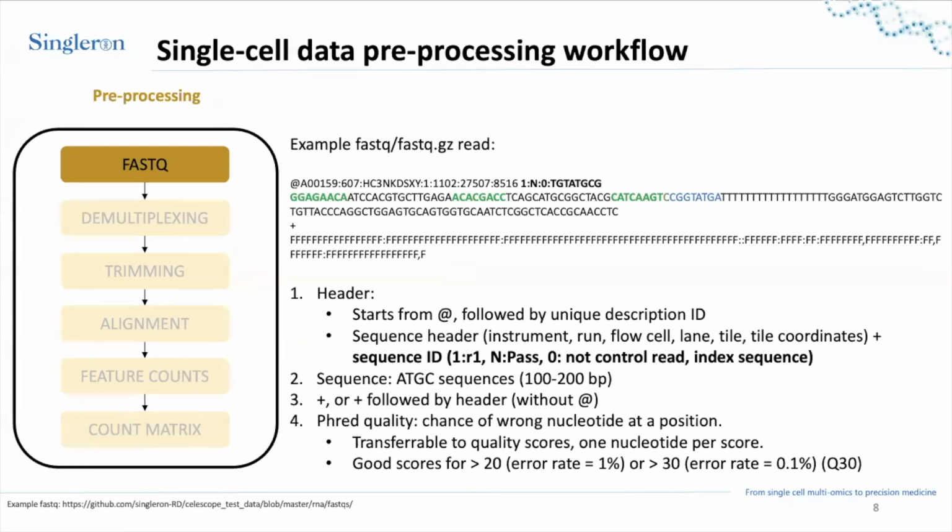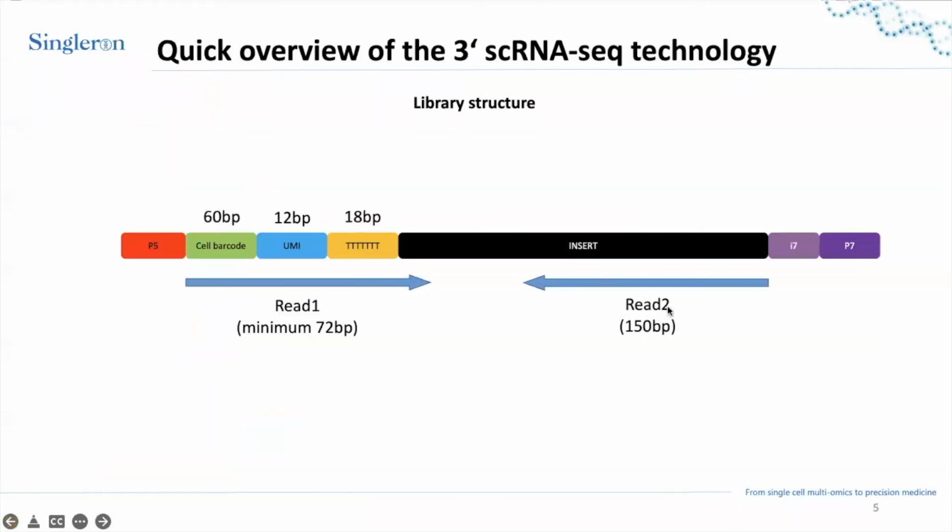We haven't done a thorough review with regard to the Fastq sequences, but I suspect it may depend on, for example, the sample qualities, like how strong the fragments are when we select and cut these insert sequences, like how strong or how clear each of the fragments are, or whether the fragments are flying around, introducing some noise to the sequencing.